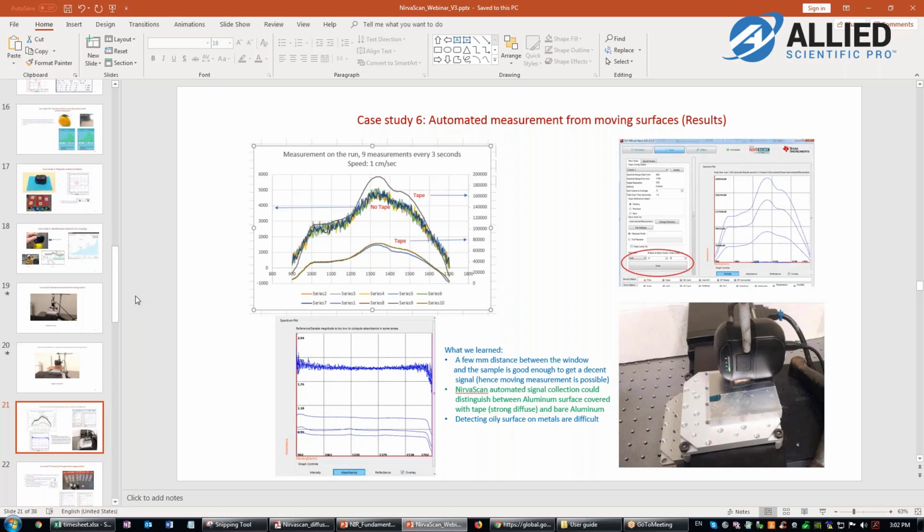So you can make a measurement. But I know your application is asphalt. I've been told about this. May I ask, is this a solid? You're going to put it on solid asphalt, or you're just looking at the ingredients, the powder form? Think of it as a composite. It's a composite of mostly 90% rocks, and the rest is this thing that is coated, right? Right, but I'm asking, is it in a powder form, or is it solid?